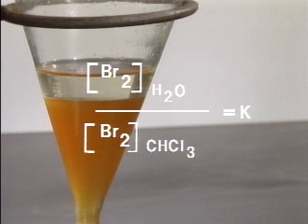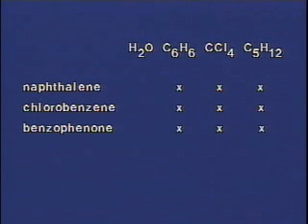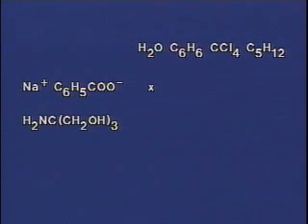It is possible to predict the solubility of solutes in solvents to some extent. Nonpolar solutes, such as covalent substances which contain only carbon, hydrogen, and a halogen, tend to dissolve in nonpolar solvents such as benzene, carbon tetrachloride, or pentane. Polar solutes, such as salts of the organic acids and bases, tend to dissolve in polar solvents, such as water. This is the well-known solubility rule that like dissolves like.